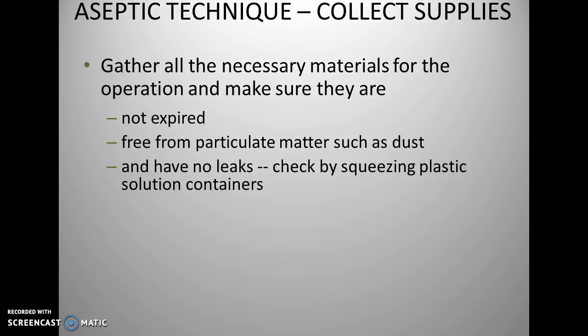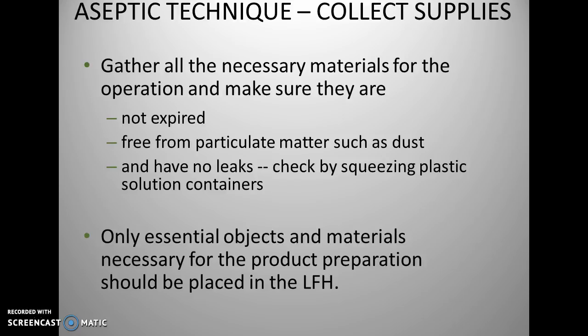Because remember, talking about dust, you have microorganisms associated with it. Make sure none of your containers that you're using has leaks, and this can be done by squeezing the plastic solution containers. Only have essential objects and materials necessary for the product preparation. That is what should be placed not only within the laminar flow hood, but also within the biological safety cabinets.